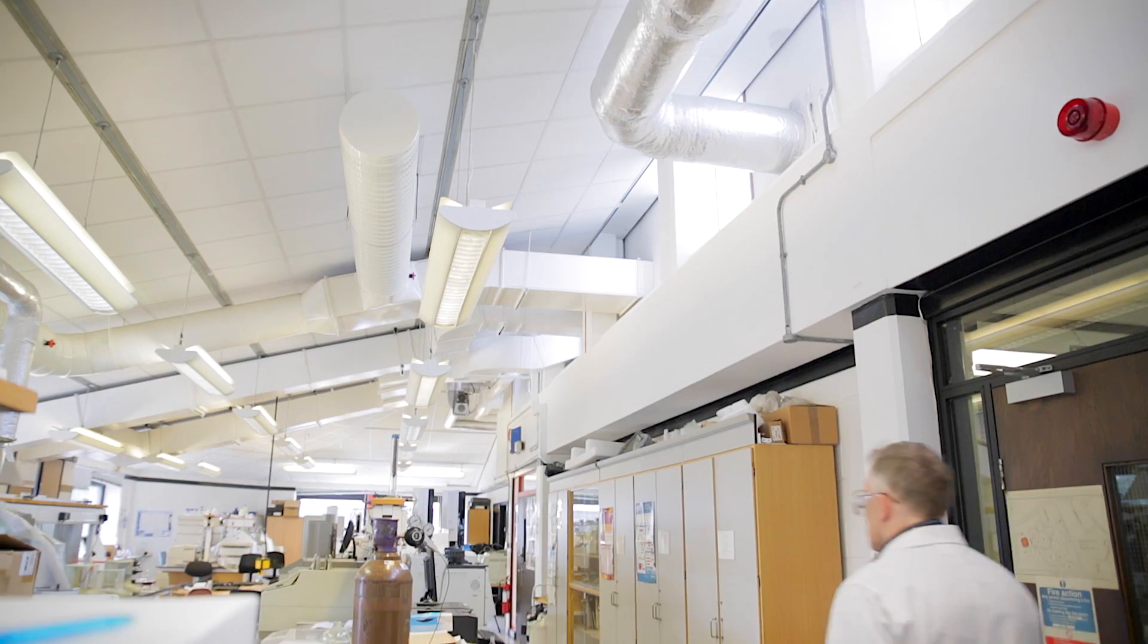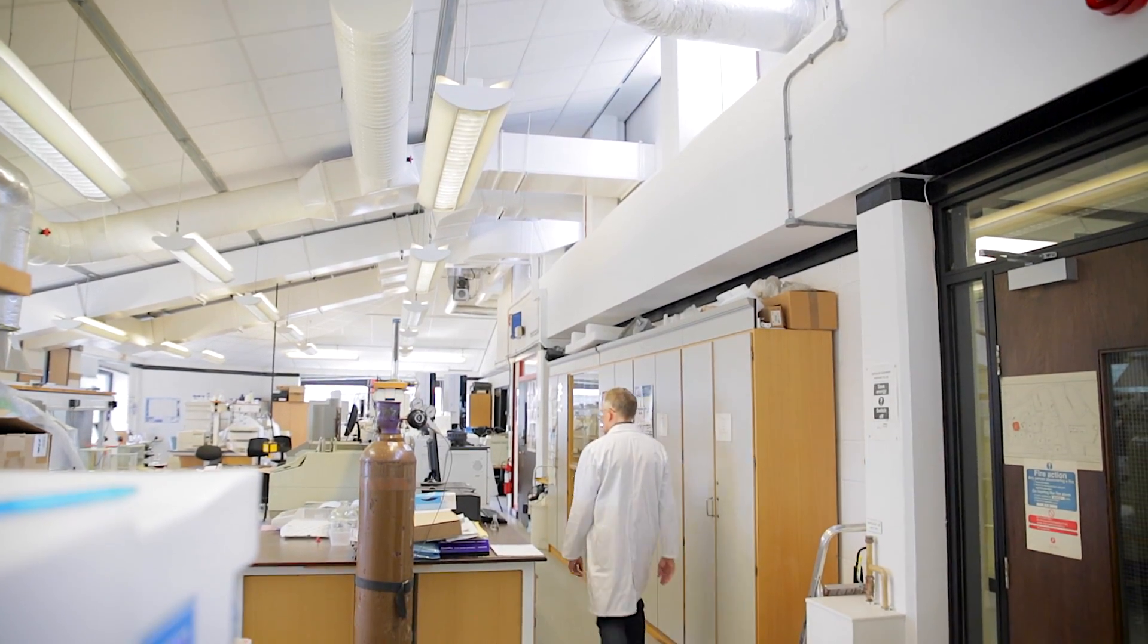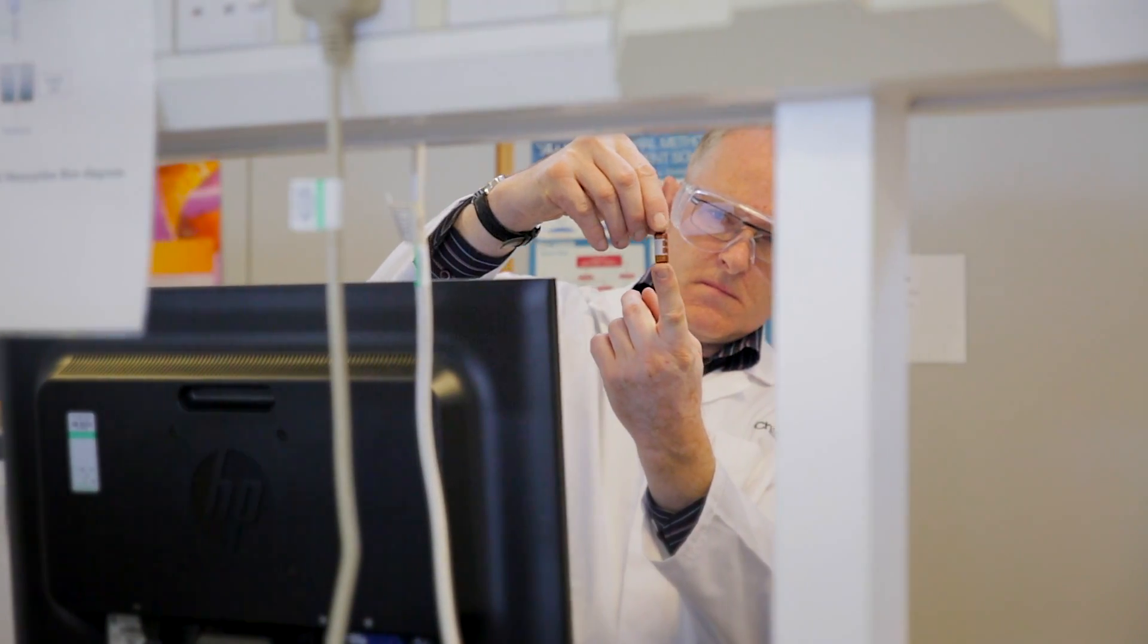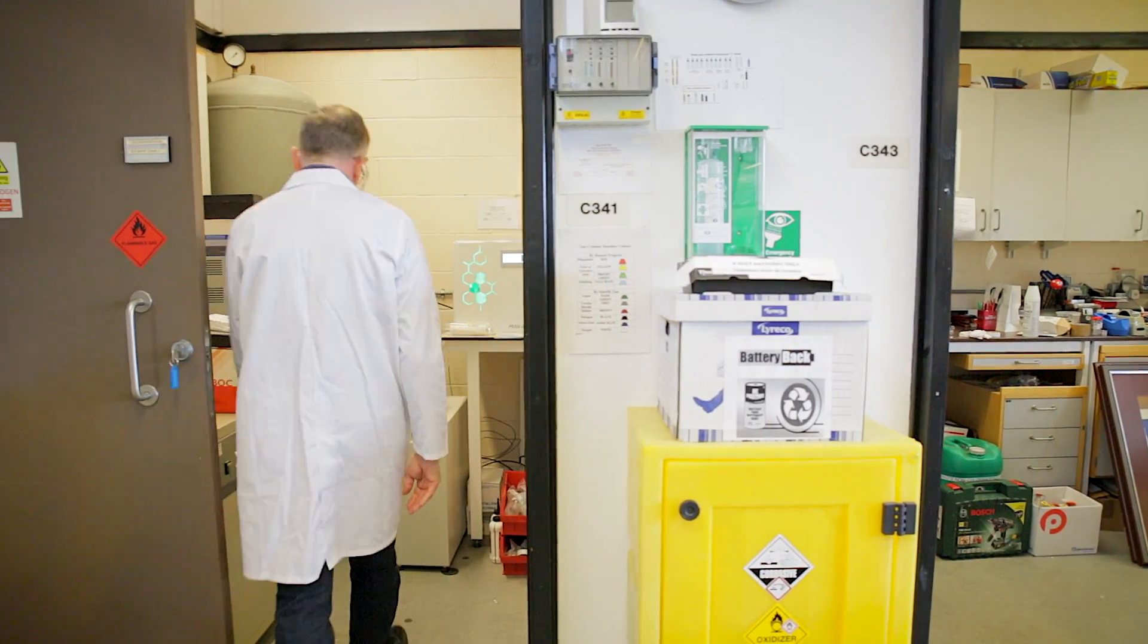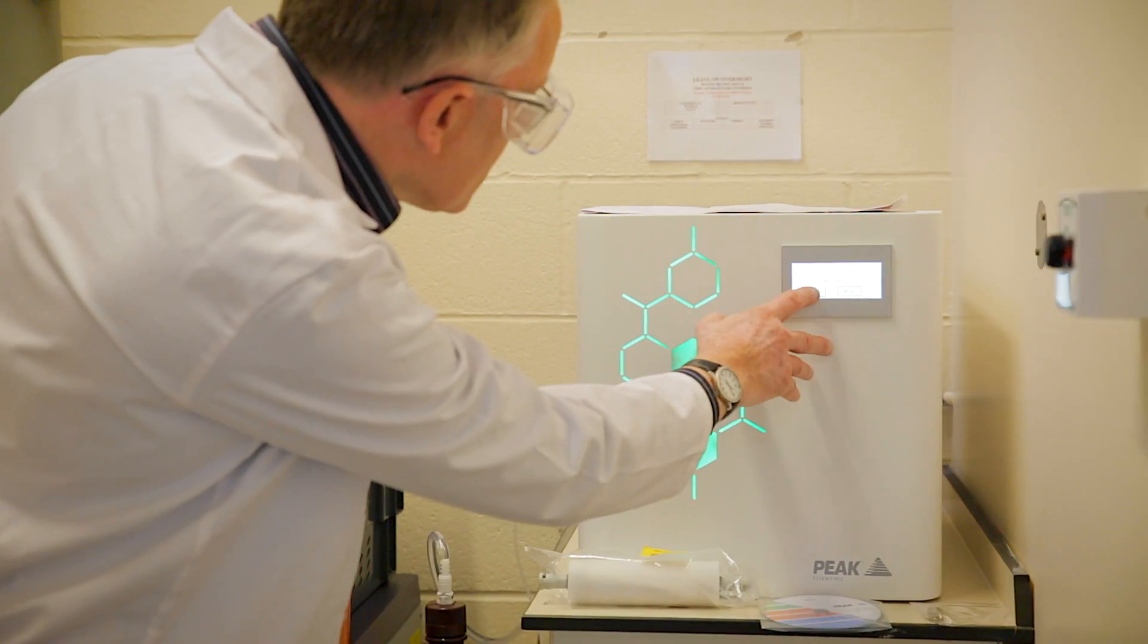Gas generators can help labs improve their productivity because it gives them gas on demand. They're not having to worry about monitoring cylinders. They've just got the gas.